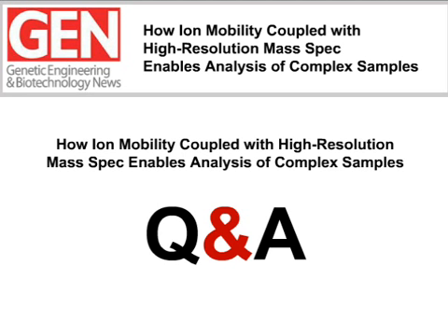We haven't done a lot of studies in this direction, but there are some other groups that have. Combining gas chromatography on the front end of the ion mobility mass spectrometer actually affords much higher selectivity and deeper coverage of different metabolites by the separation of chemical noise. So I think GC ion mobility mass spec has a lot of upside potential, in particular in metabolomics.